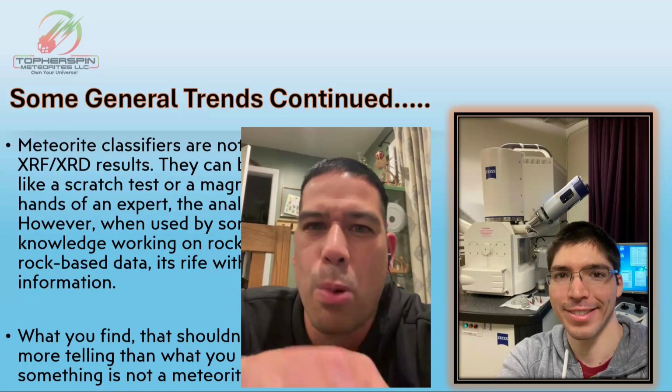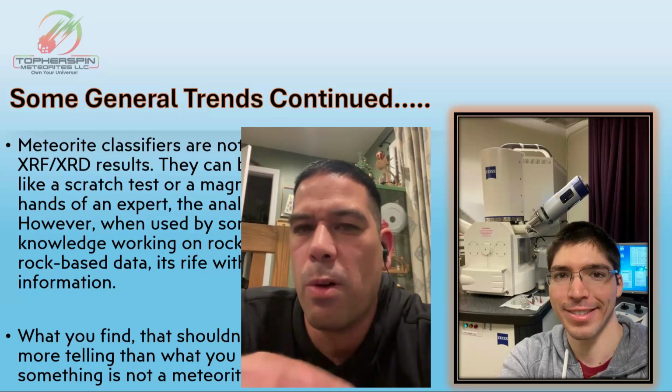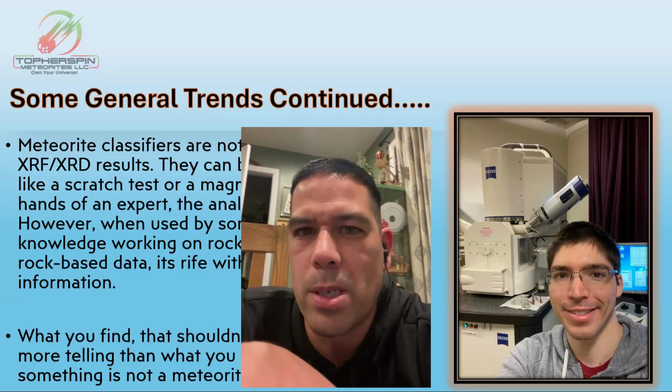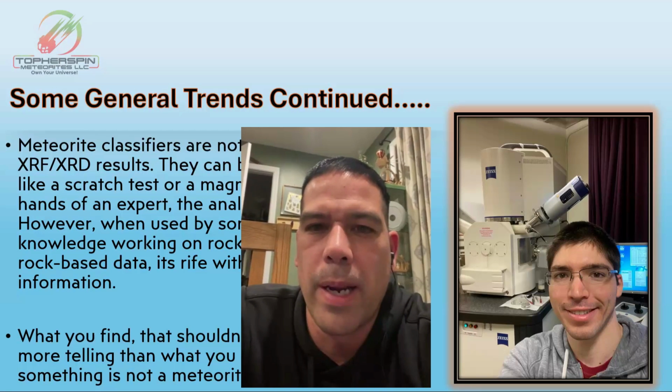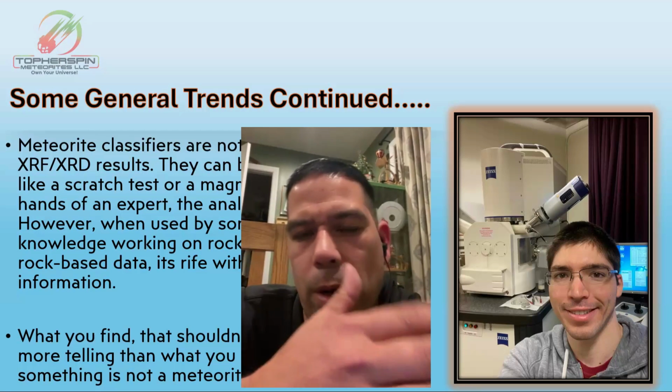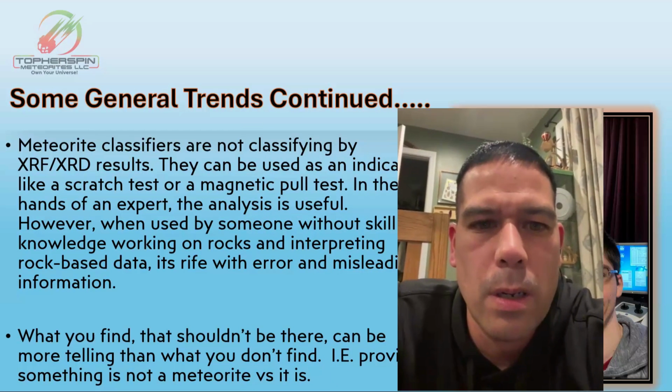So you can tell exactly which mineral it is. You can move around and tell exactly what's at each point as you read them. Same thing, you're going to want to hit 20, 40 points in order to get accurate data. Awesome. Thank you, man.